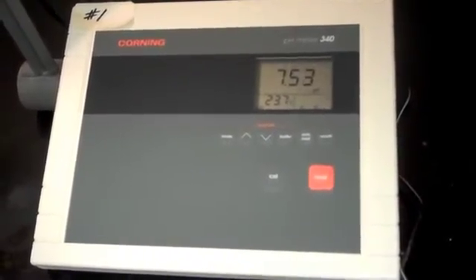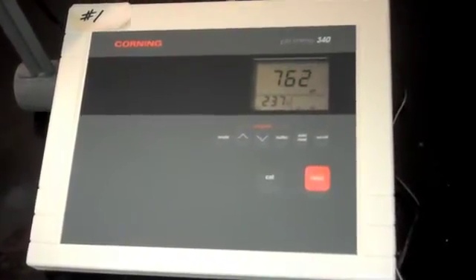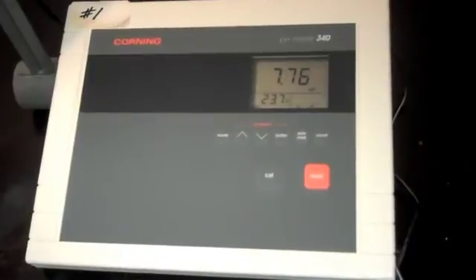Once I get to about 7.5 or so, I slow down my addition of sodium hydroxide and go very slowly so I don't overshoot that endpoint.